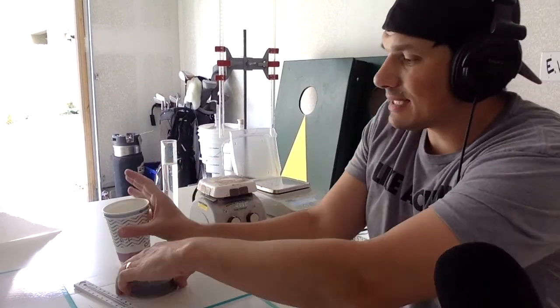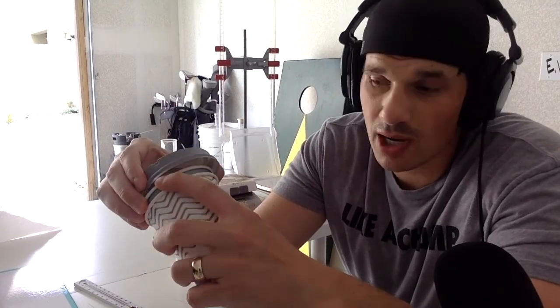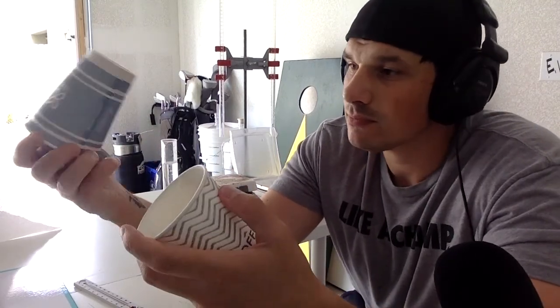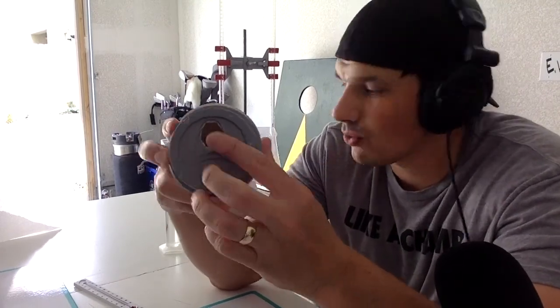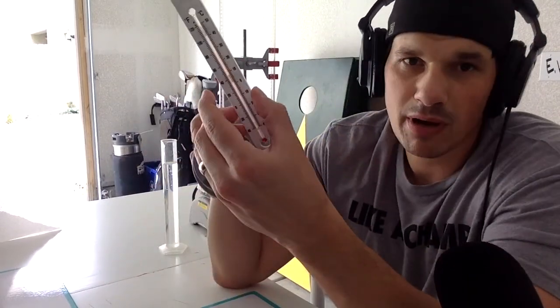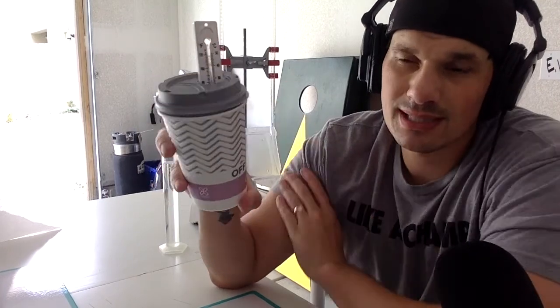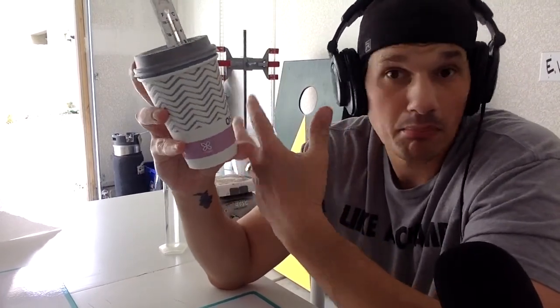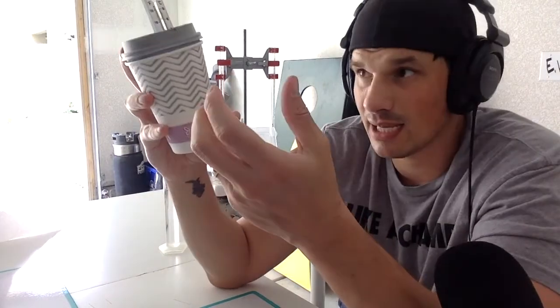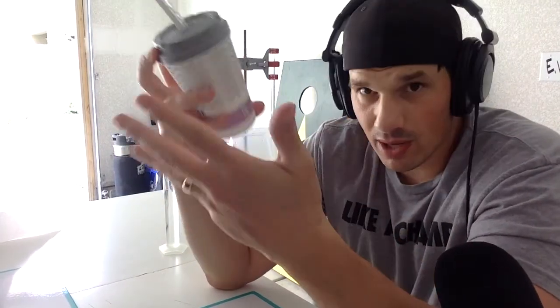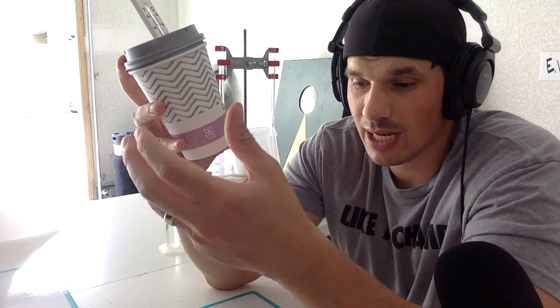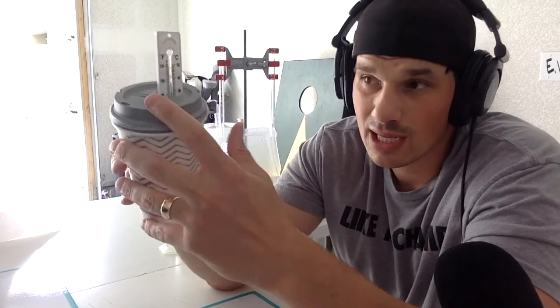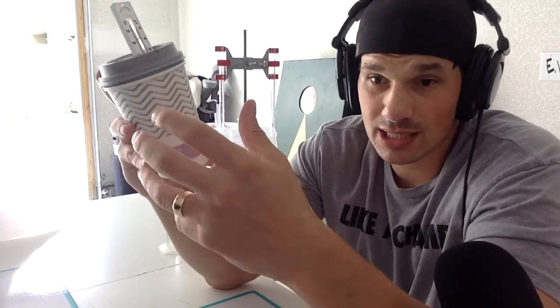What I'm going to do is I have my calorimeter. It's just essentially two styrofoam coffee cups. And then I have a lid to close the system. I'm going to put the lid on top and that hole there is for my thermometer to sit in while the system is melting the ice. So as the energy from around us, I'm not going to heat the solution up because I don't want to put energy into it. I want this reaction to occur naturally. So I'm going to see how much energy this ice is going to take from the outside system and input it into this closed system.